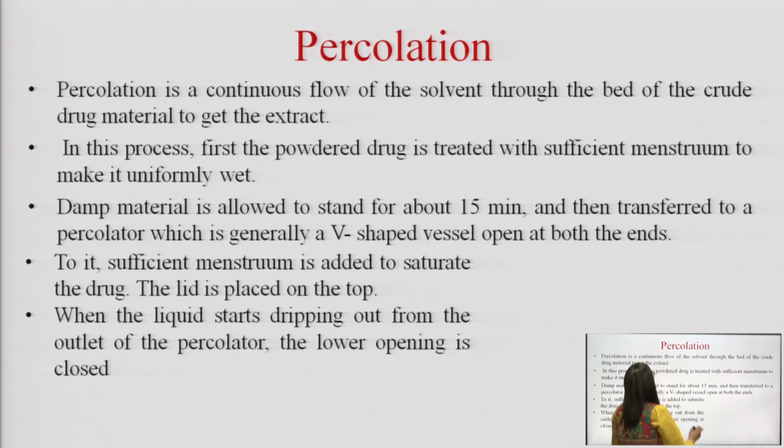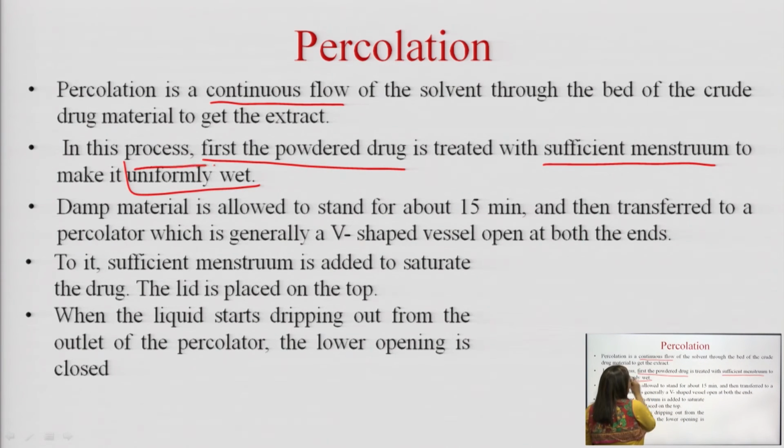Next comes percolation. Now, this is a continuous flow method, unlike maceration. Here first the drug is powdered, then treated with a sufficient amount of menstruum and uniformly wetted.